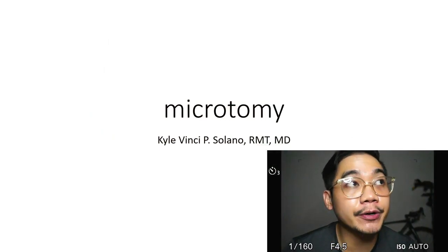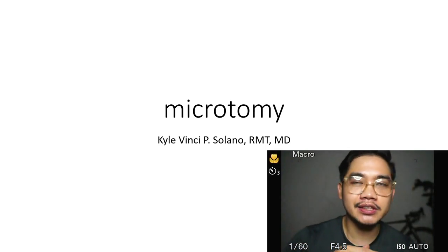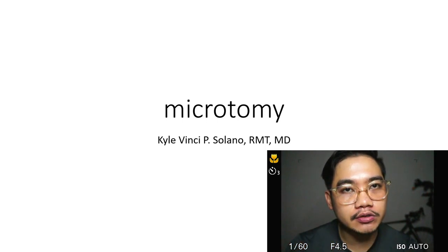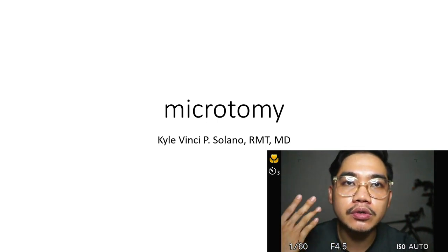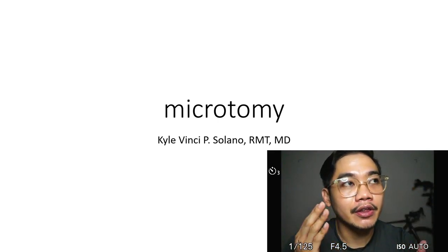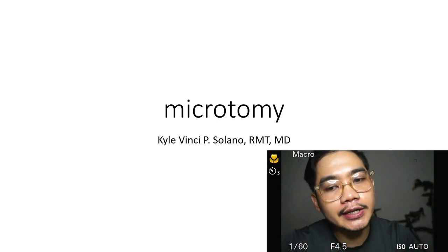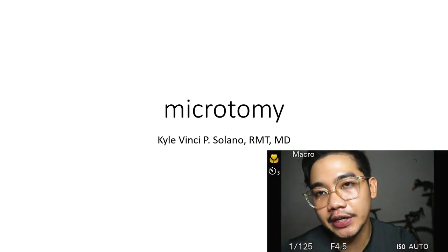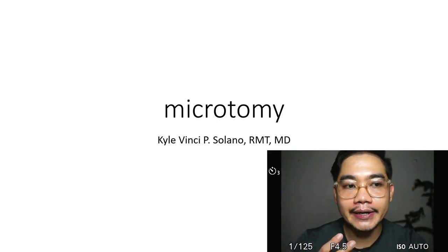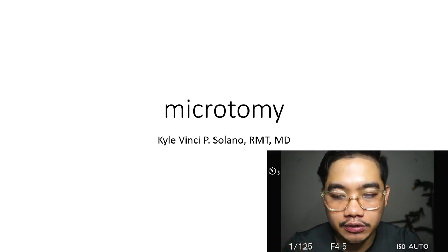So what is microtomy? Microtomy simply means micro, meaning small, and tome, in Greek, meaning to cut. So small cuts of what, Doc? Small cuts of the tissue, so we can think of it as a fillet. We fillet the tissue, and then we put it on a slide so that we can see what's inside, the tissue and the cells, and either determine if there is a malignancy or there is no malignancy.